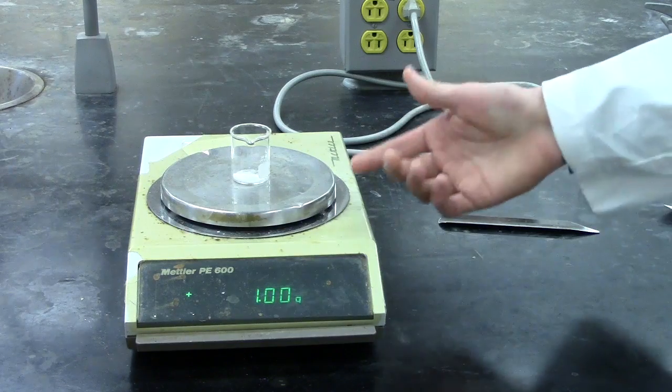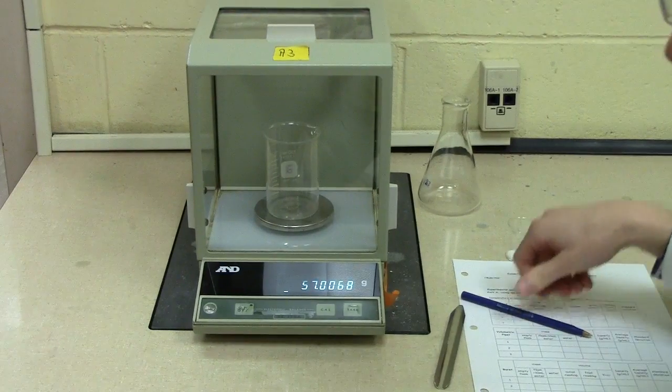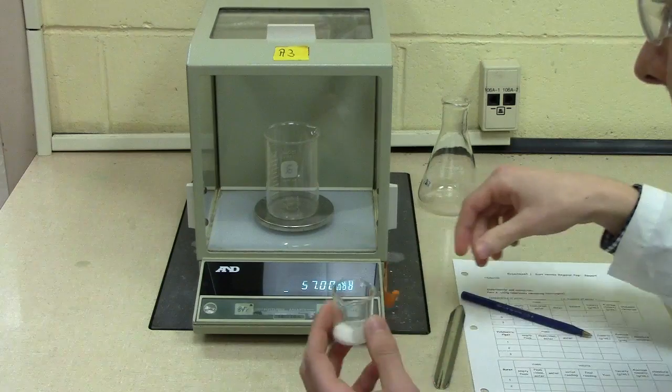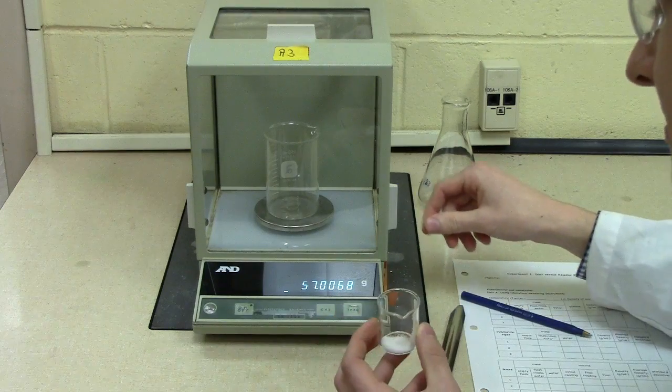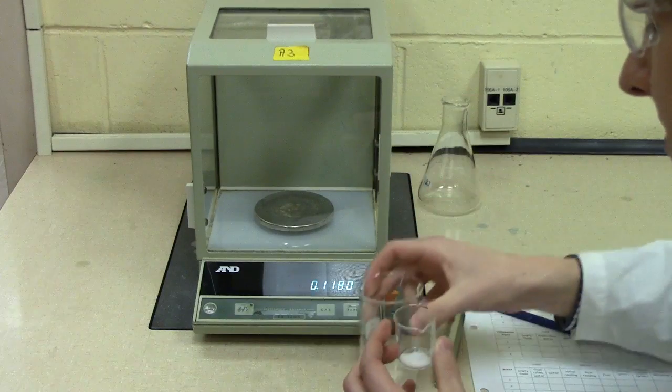In the second step, weigh one gram of your substance using the top loading balance. Step three, once you have weighed out compound from the top loading balance, it can then be loaded into your empty and weighed beaker.